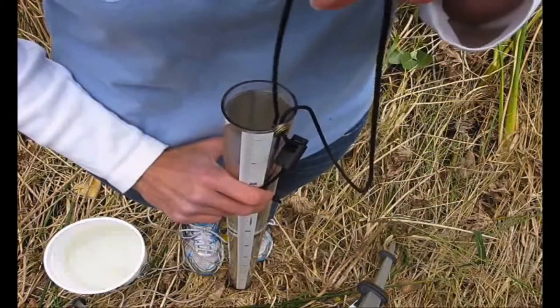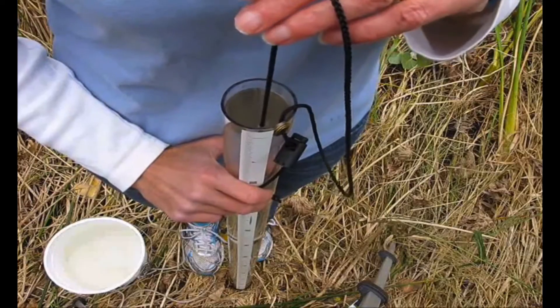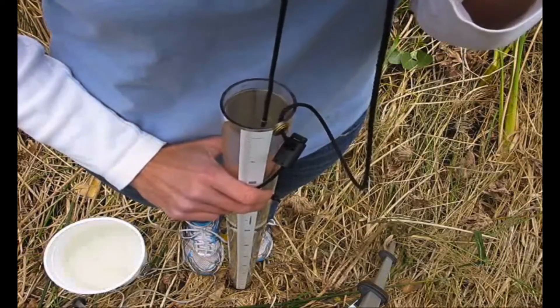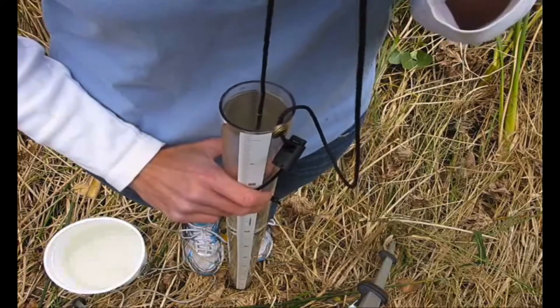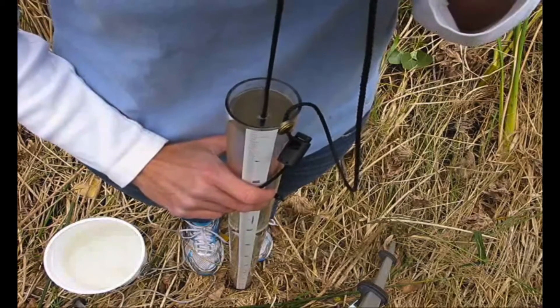Once the disc disappears, raise it again until it reappears. Do this as many times as you need to until you're comfortable with identifying the midpoint.